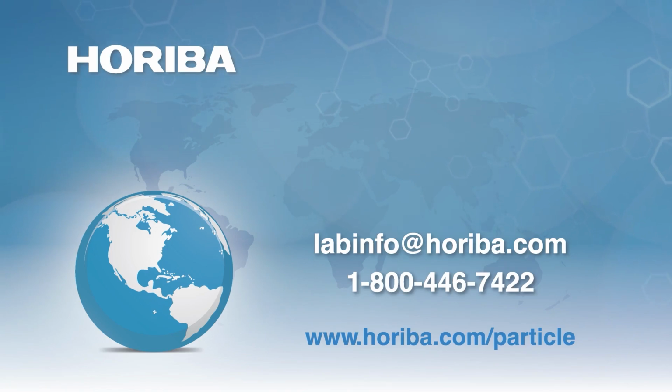If you have the SolvoFlow or the MiniFlow, then the ultrasound to break up dispersions can also really break up your particles. If you want to have some fun, put an emulsion in there, just a liposomal sample or something like that, and then hit it with ultrasound, and you'll have all sorts of havoc breaking loose in your system. So you gotta watch as you dump energy into your system that you're not destroying your particles. Great question, thank you.